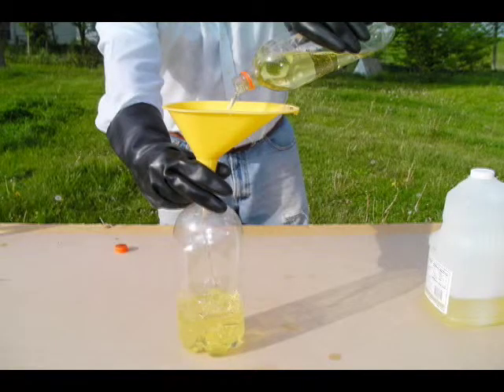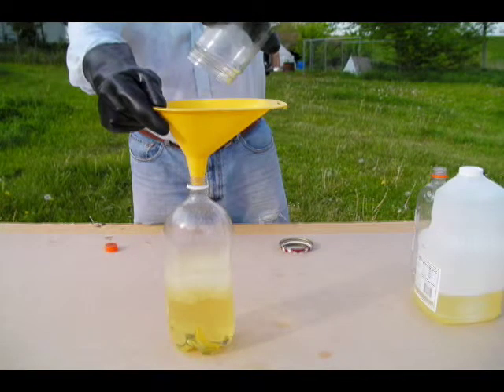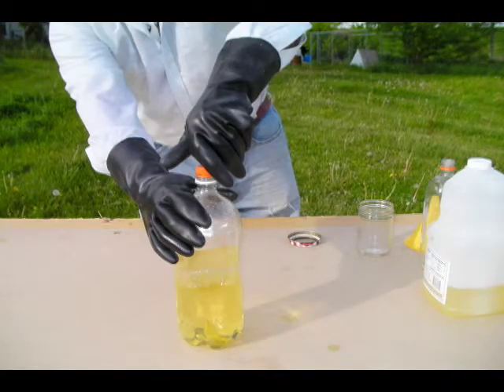Add the methoxide solution to your oil using a funnel, and be careful not to spill. If you spill, clean up the material immediately with paper towels and dispose of the contaminated paper towels safely. Put the cap on the soda bottle and shake vigorously for about 30 seconds. Let the mixture settle, then shake about every 10 seconds for 10 minutes. Repeat this three times.